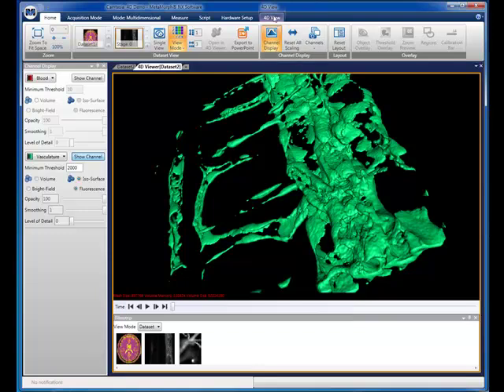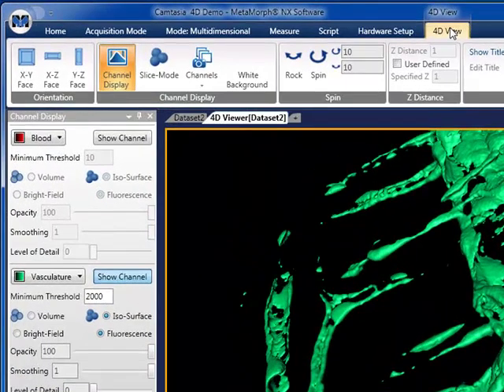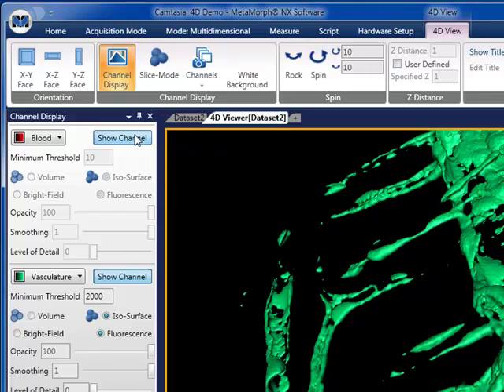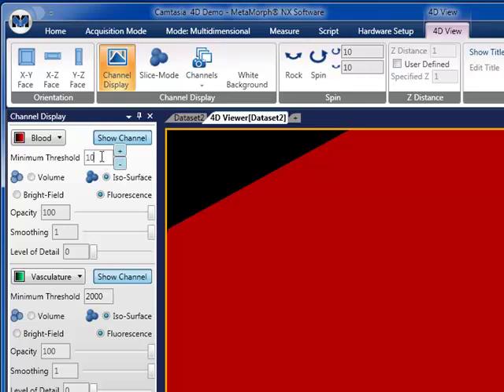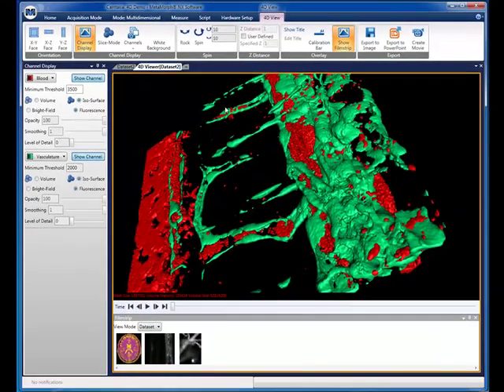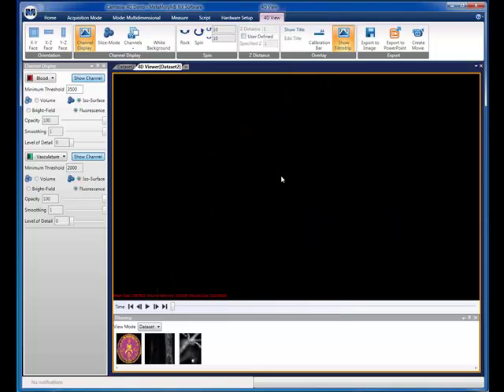Now we will switch over to the 4D tab and set up to simultaneously display the other channel. Again, we will set a threshold, this time to highlight the zebrafish blood. Now we can zoom in and rotate to better understand the relationship between the zebrafish blood and its vasculature. Notice how the blood is contained by the vasculature.